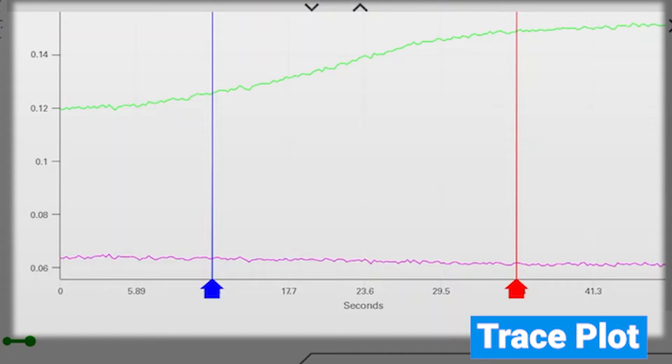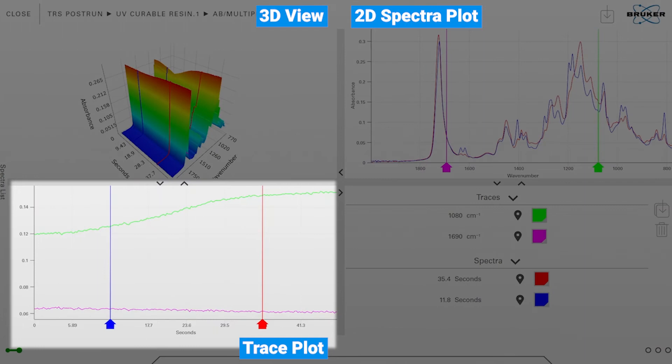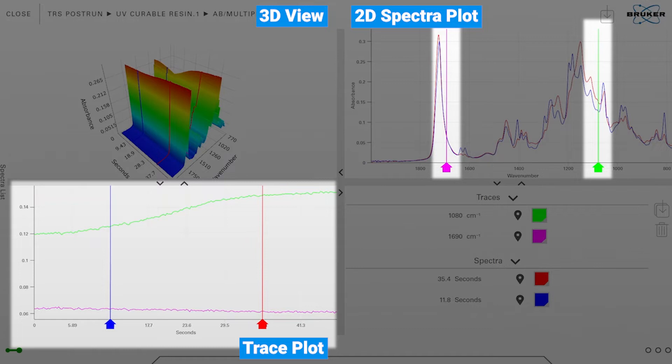These are the traces, so these are the information on how the band changes over time. We set the pink colored marker and the green colored marker which are shown in the upper right corner to a specific wave number, and then the so-called trace is calculated and shows if the band intensity is changing over time. This is what we see on the lower left corner.